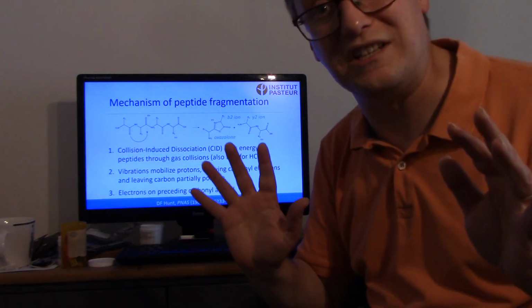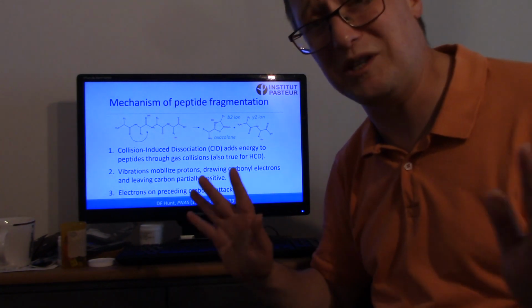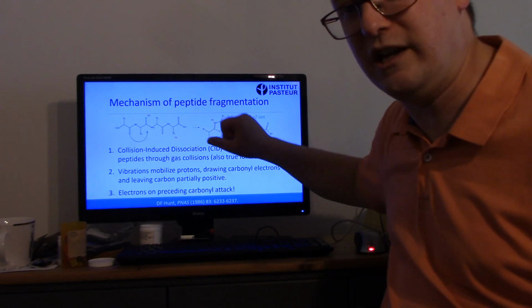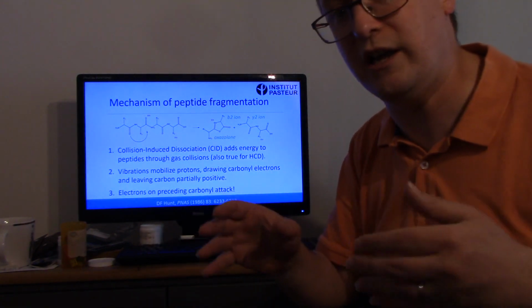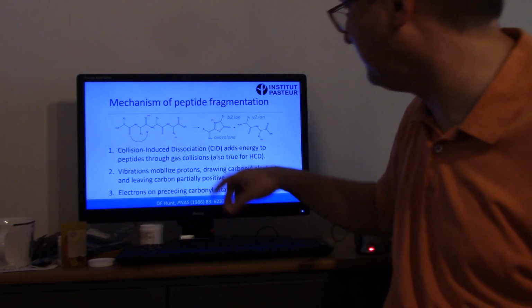And that's not very stable because carbons do not like being attached to 5 things at once. They simply don't. So what happens is that we end up with the circularized part of the ion departing as what we call an oxazolone, and the rest of the peptide ion departs as a smaller peptide ion, essentially.